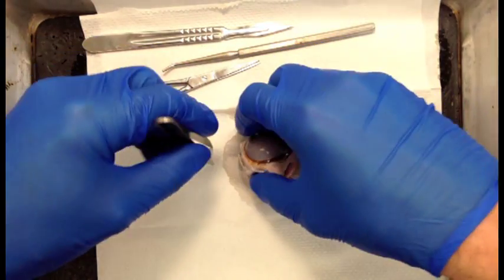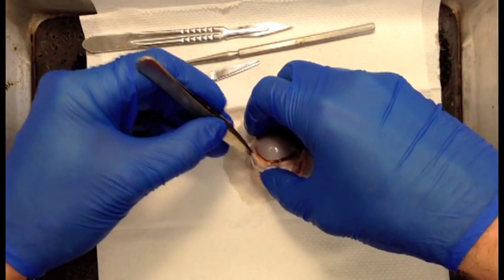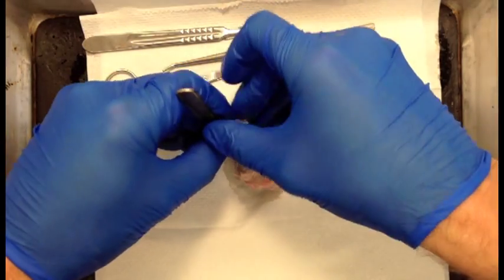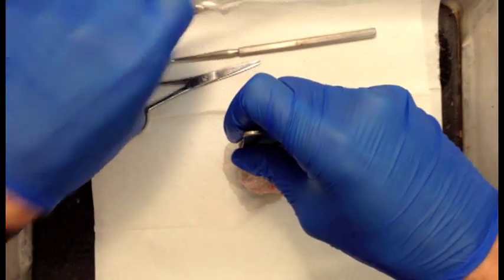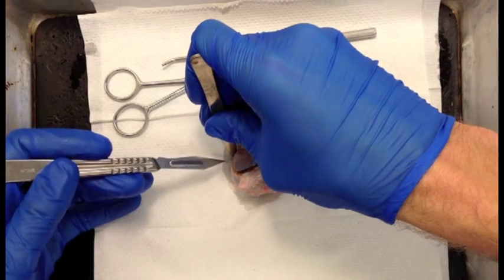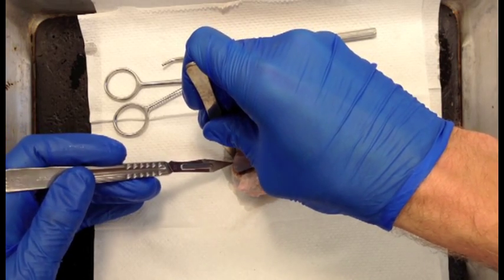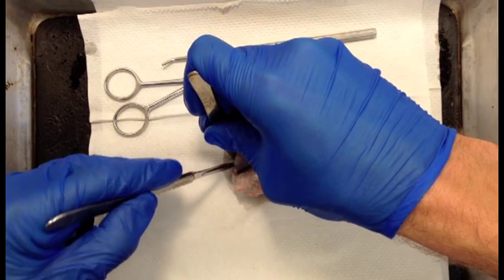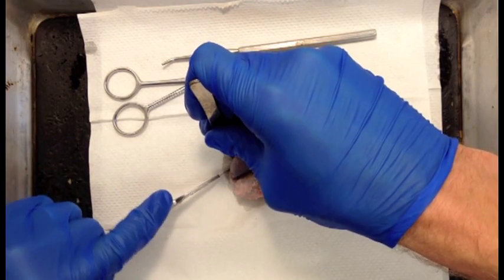and pin it down to the dissecting tray, so that when you take the scalpel, it pushes on the sclera into the dissecting tray, not straight into the eye. And that way you don't put the eye under any pressure. So I'm just making a small little hole here.